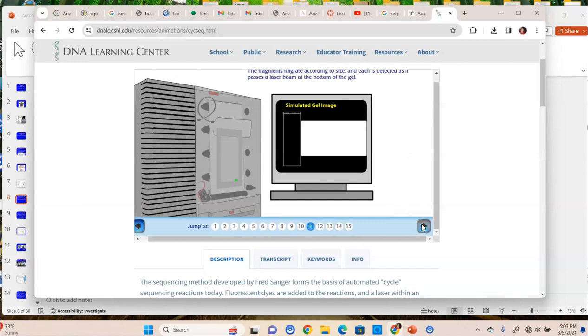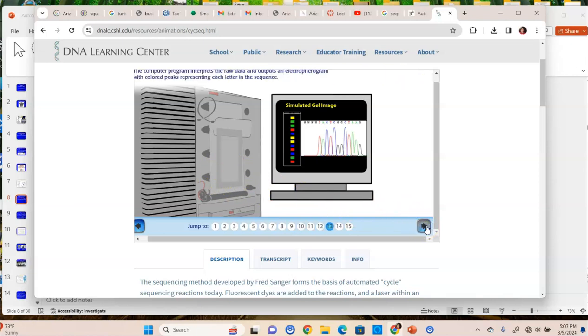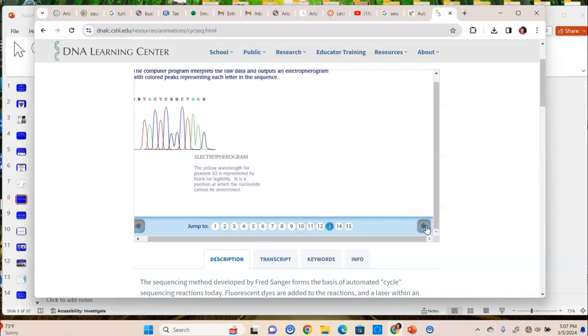So this is basically what I was drawing on there. And so here's the laser moving back and forth. Here's our sequence. And the laser will excite and tell us what color it is, and then it will give out those peaks so that we know what the sequence of DNA is. These signals are not as strong as, say, these Cs. For example, that could be from anything. And if there's any dirt or any background on that, or anything that autofluoresces, that can wreck your sequence too. So this has to be done in pretty sterile environments.